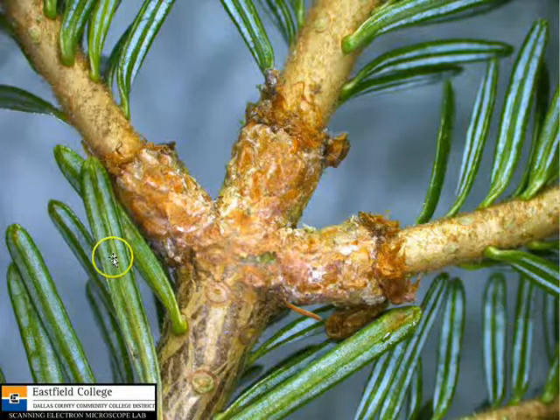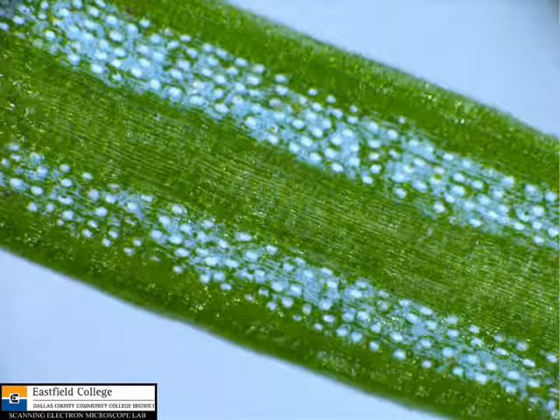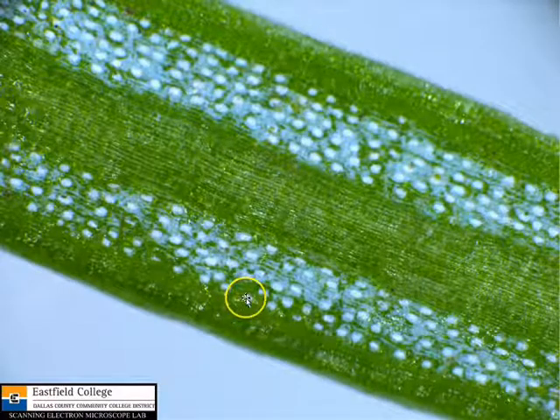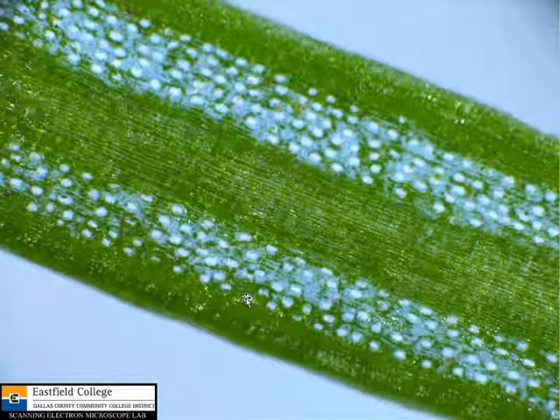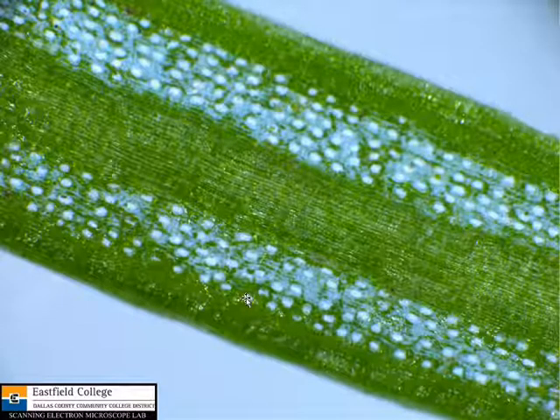Again, you can see the needles off the tree, and you can see where they were attached. Here's the top surface of the leaf, and you can see these little pits. The blue color is kind of an artifact of the dissecting scope, where the light is reflected out, but it's still kind of a nice looking picture.